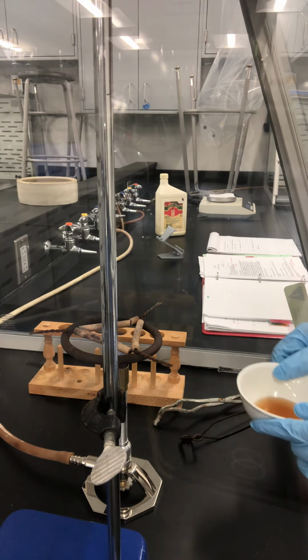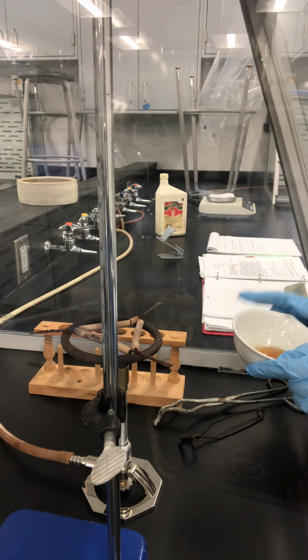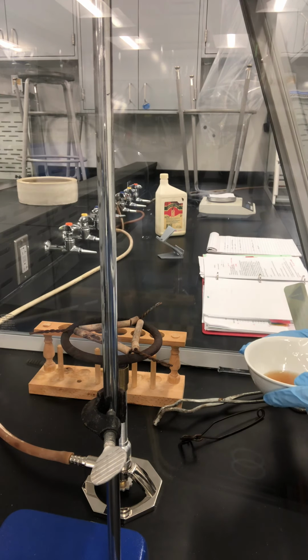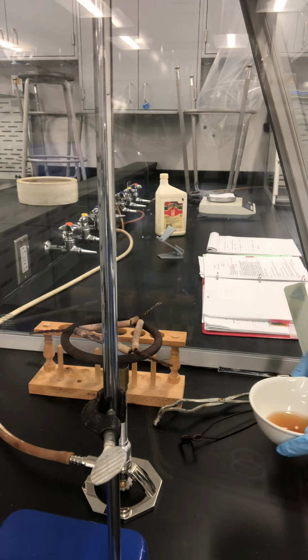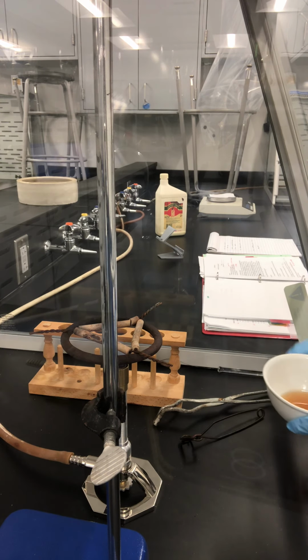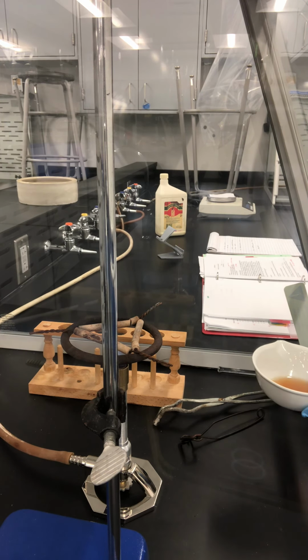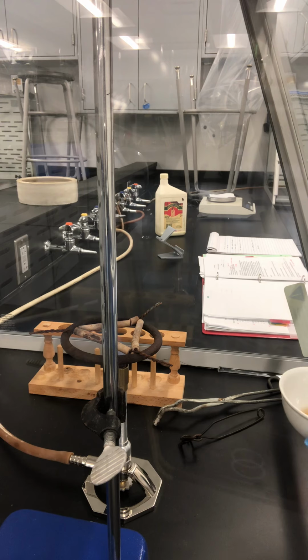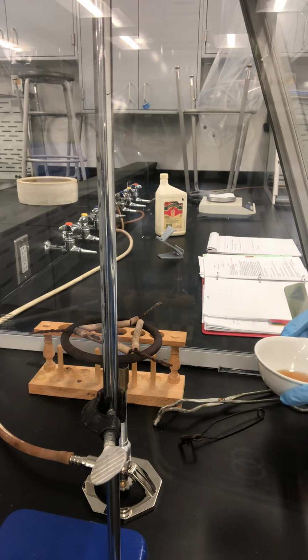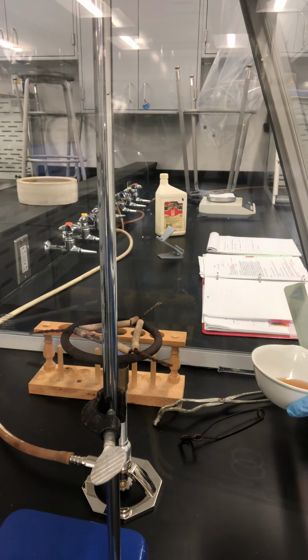Okay, with the oil I added, now it's 97.95 gram. So 97.95 gram is around 10 gram of oil added. I have to do the calculation to know the exact number, and we can do that later. Step 5, heat the dish and sample carefully under the hood until the contents can be ignited with a flame.